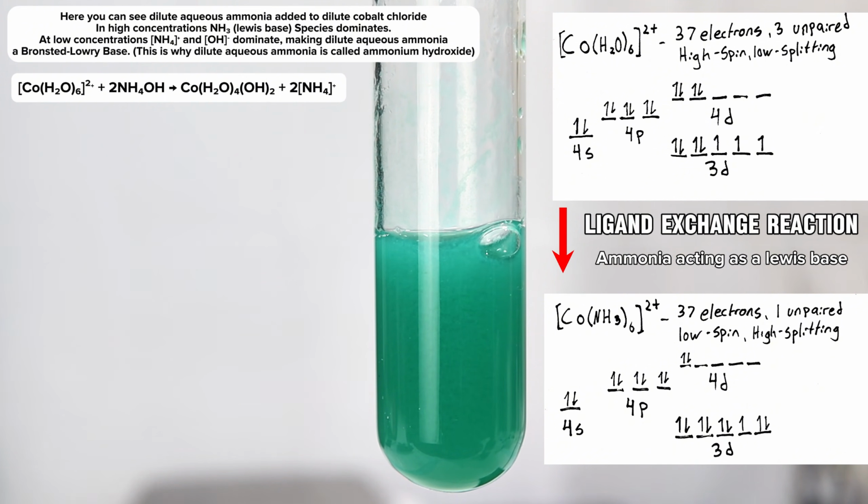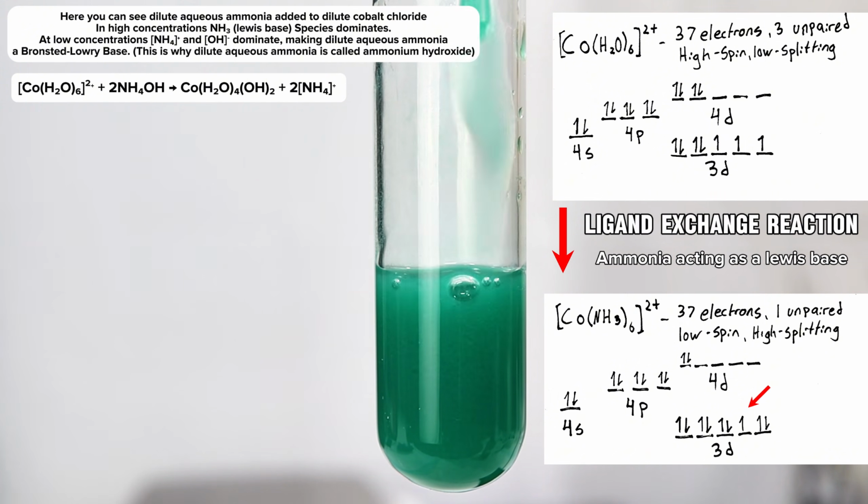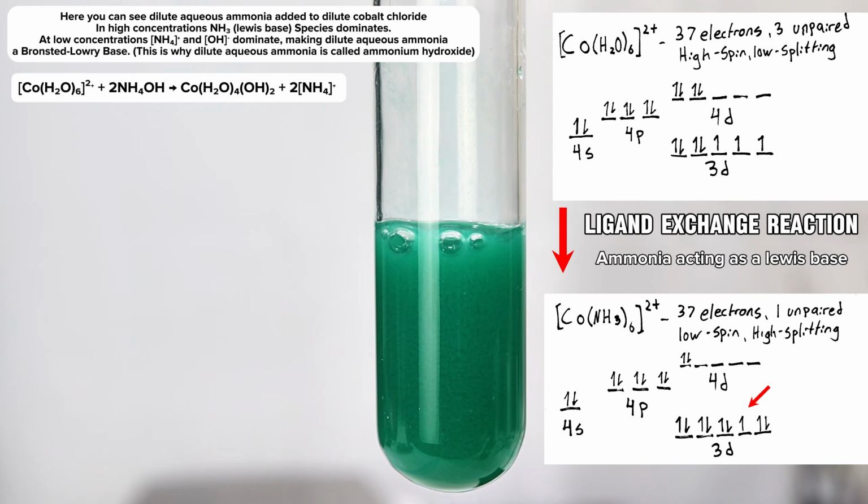This resulting complex is far more stable as a result, but the one unpaired electron means that substitution is still possible. Since ammonia itself is neutral like water, its ligands do not contribute to the charge of the resulting molecule the way hydroxide would, and so the resulting complex ion still has a +2 charge.